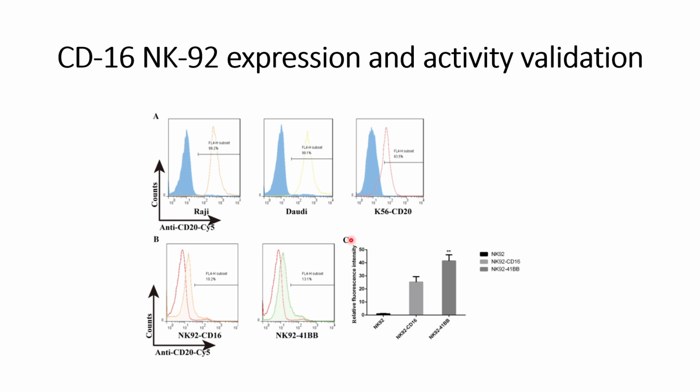So these things they later verified with the ELISA also.